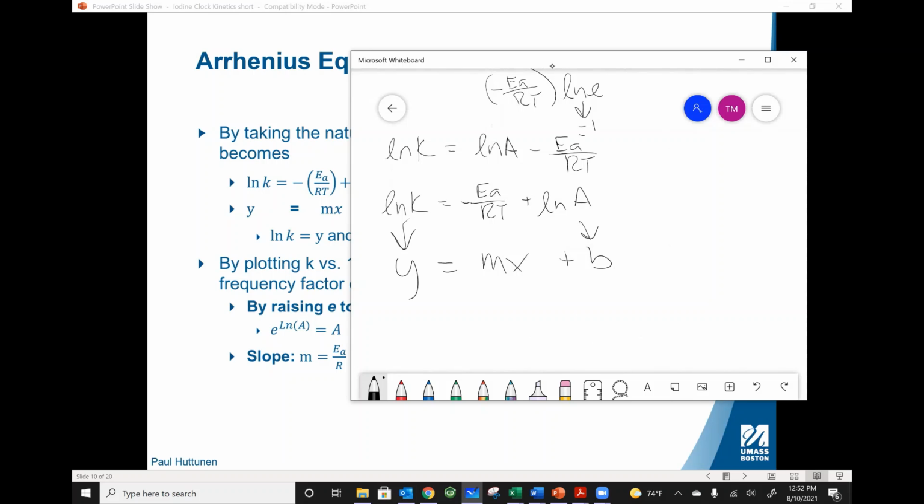So that means our x is always the independent variable. The independent variable is the thing that you are changing in your experiment. Y is our dependent variable because the outcome of y depends on x.